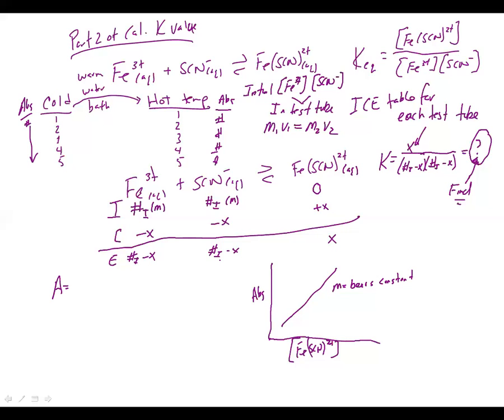And in this case, what you would have for each test tube that's hot and cold is the absorbance value. You would have Beer's constant for part 1 that you did. And you could solve for C. C would equal A divided by B. And that will give you the concentration of that test tube for our product at equilibrium. Any questions on that?